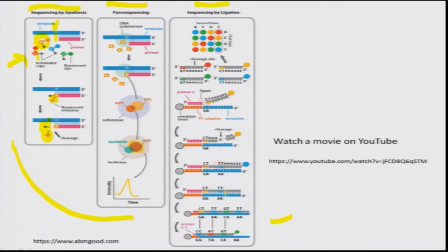In pyrosequencing, it depends on a kind of chemical reaction that happens here. Whatever moiety is added, the chemical that is released would give a different color depending on the base, right. Again, it is a similar method. What fluorescence comes out for a given base, that would be read out. The difference is, at a given time you are going to give only one particular base.